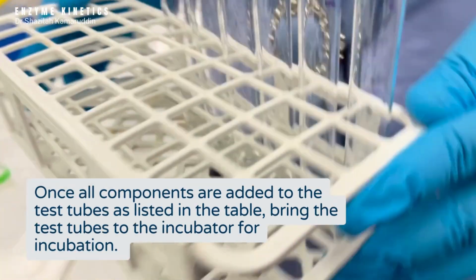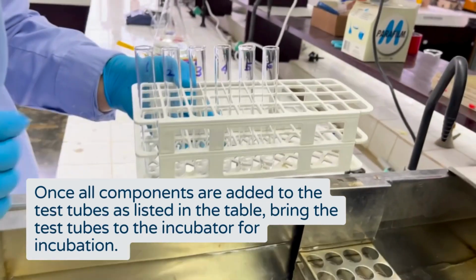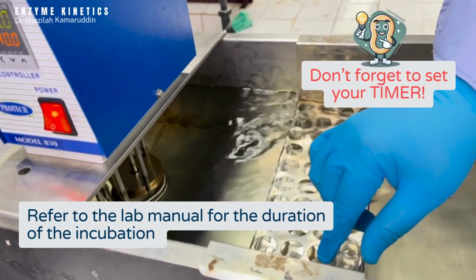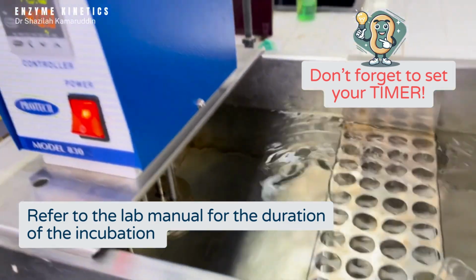Once all components are added to the test tubes as listed in the table, bring the test tubes to the incubator for incubation. Refer to the lab manual for the duration of the incubation. Each experiment might need different duration.